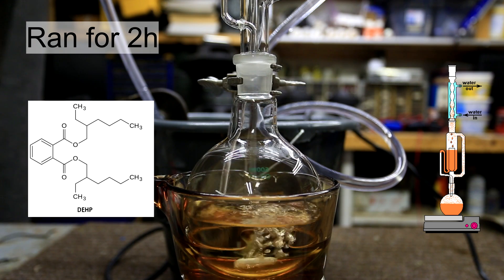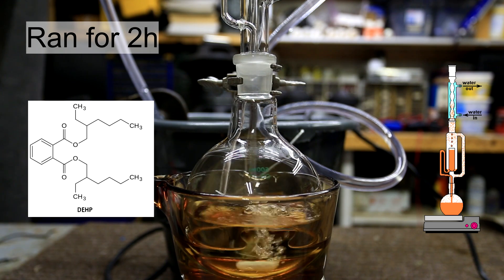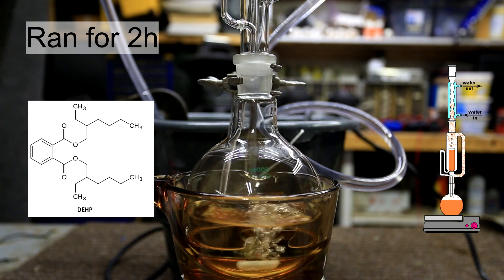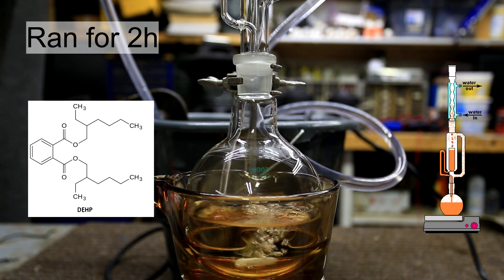To the right is a little cartoon of a Soxhlet extractor in action from Wikipedia. If you want a better explanation on how one works you can watch my video on how to extract capsaicinoids where I use a Soxhlet extractor and explain it in more detail. In short, hot solvent travels up the sidearm and collects in the Soxhlet extractor and once the solvent reaches a certain height, it all drains back down into the round bottom.